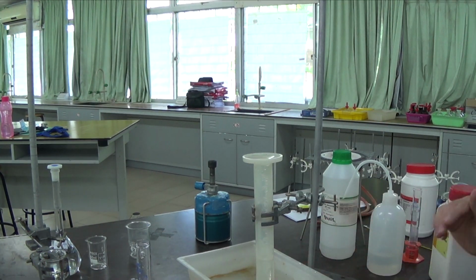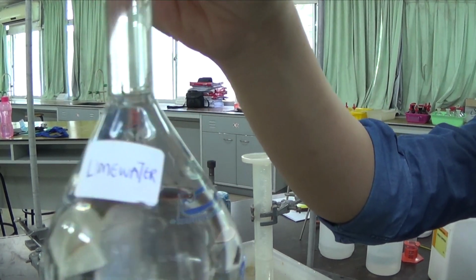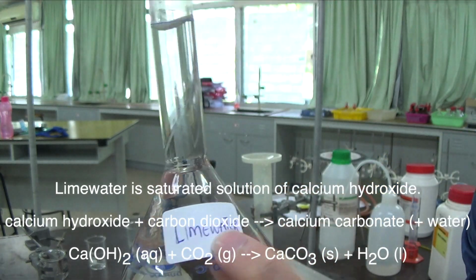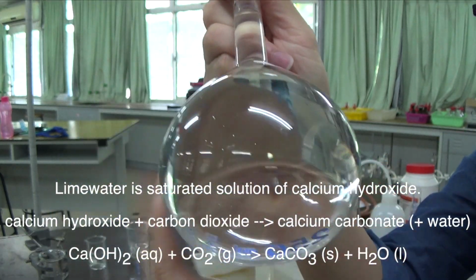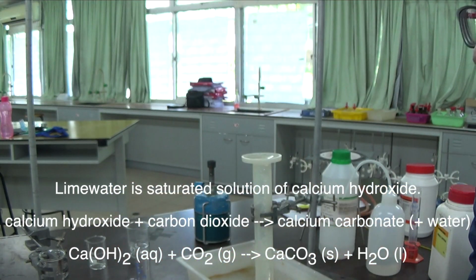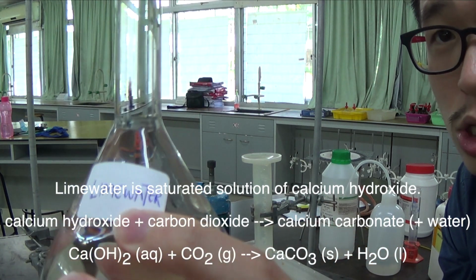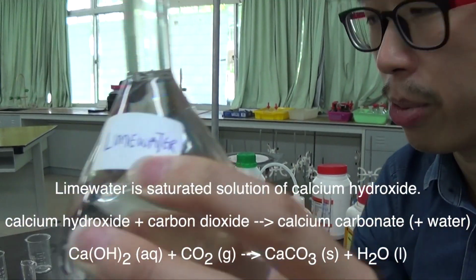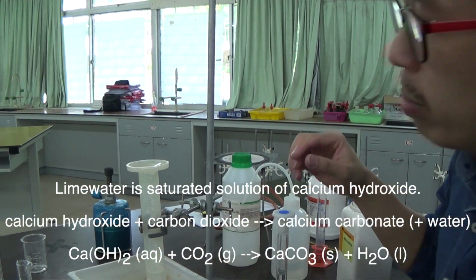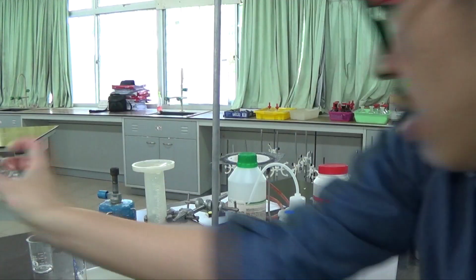So what I'll do is I have this thing called lime water. Lime water is used to test for carbon dioxide. Lime water is this colorless solution. So lime water plus carbon dioxide will give you a white precipitate, a white solid, a cloudy, milky precipitate. So this reaction produces carbon dioxide. Instead of collecting the gas, I will bubble the gas through this thing here.